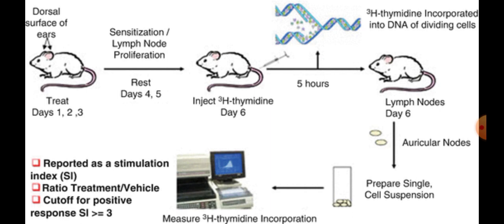So the limitations of local lymph node assays are: the local lymph node assay may not be appropriate for certain metallic compounds, surfactants, and high molecular weight proteins, strong dermal irritants, and materials that do not sufficiently adhere to the ear for an acceptable period of time during treatment.